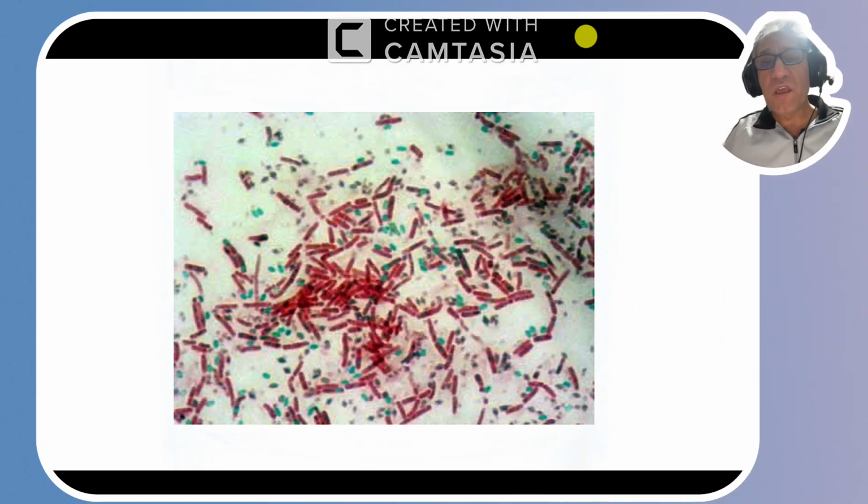Look, these are the slides under the microscope. You're going to find it like this. Which is the red and which is the green? We're going to talk about it in the procedure, of course, and in the test today.